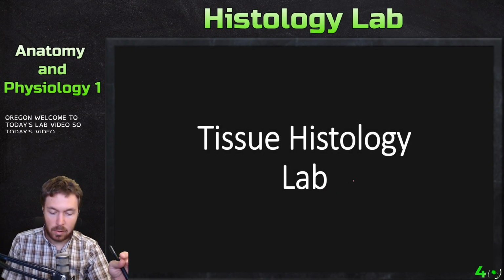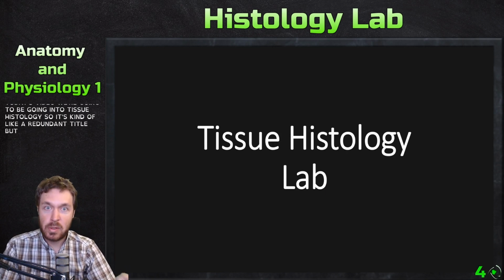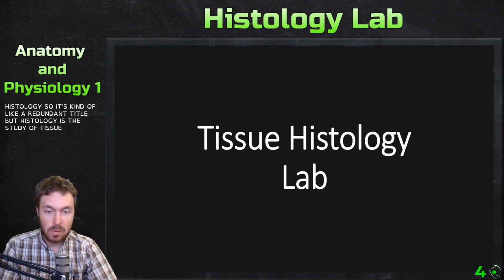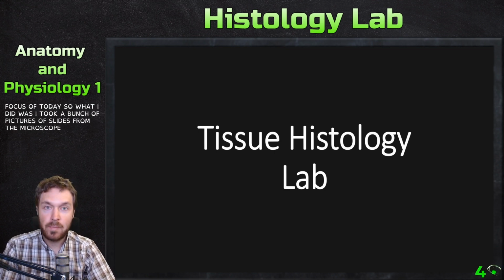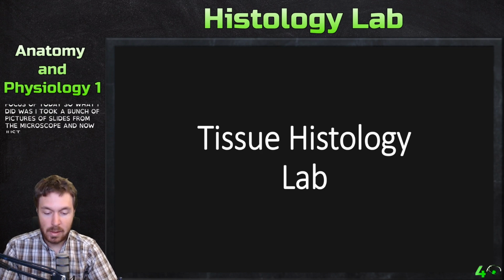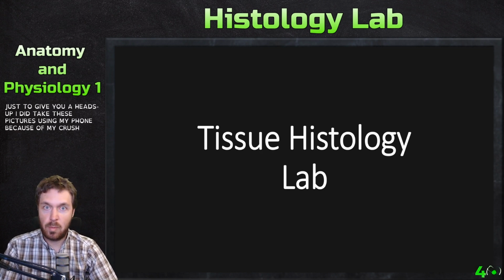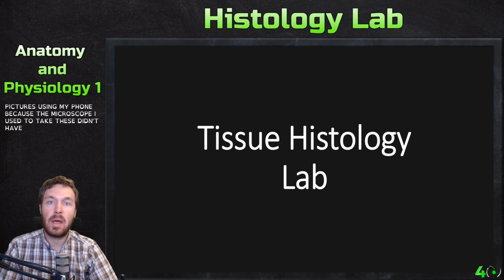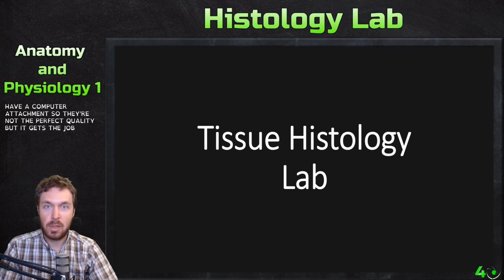Today's video we're going to be going into tissue histology. It's kind of a redundant title, but histology is the study of tissues. What I did was take a bunch of pictures of slides from the microscope. Just to give you a heads up, I took these pictures using my phone because the microscope I used didn't have a computer attachment, so they're not perfect quality, but it gets the job done.